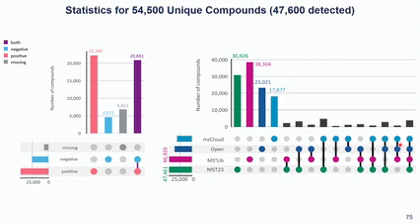So we see which compounds we only detected in positive mode, and most of them are actually detected in this mode. So that's why maybe most people normally use only the positive polarity. But then we also see negative there in blue, that actually less than 5,000 compounds were detected only in negative ion mode. So in the end, it really depends. If you do untargeted, you might lose information because you're only acquiring in one polarity. Or if you're interested in one compound and you cannot see it in positive, maybe we need to go back and think about the polarity setting. And of course, the ionization source, ESI or APCI, might also influence what we actually see.